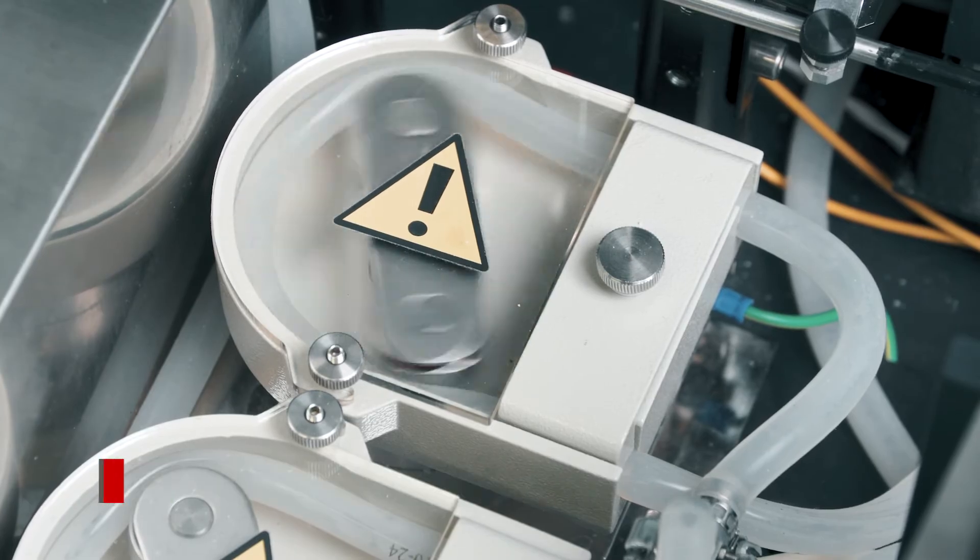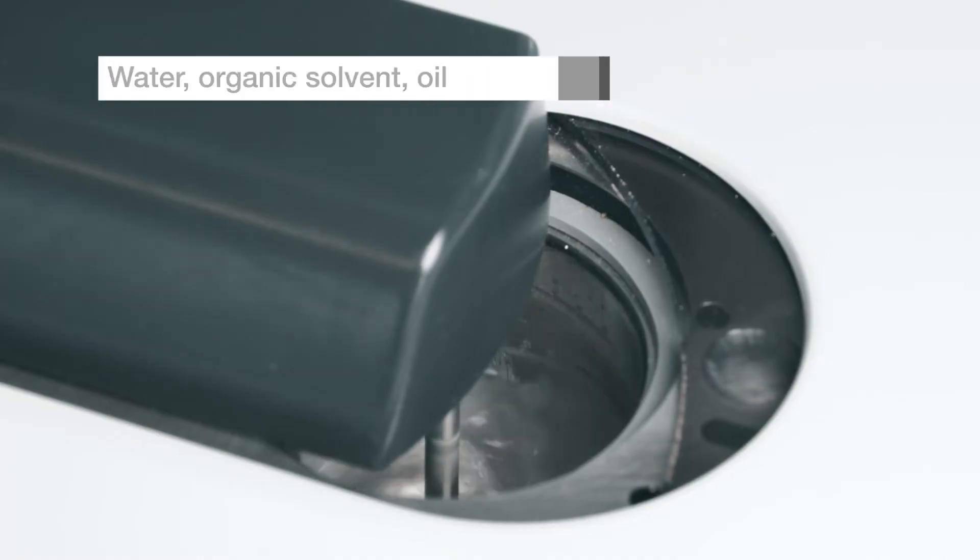The carrier liquid can be water, organic solvent, or oil, depending on the sample, which can be liquid, creamy, or powdered form.